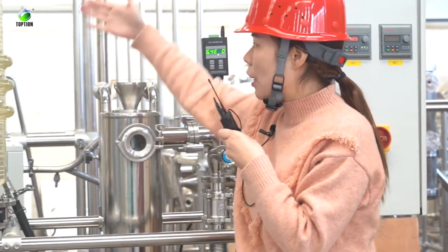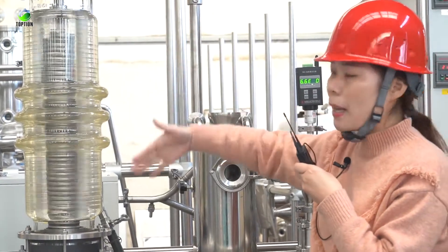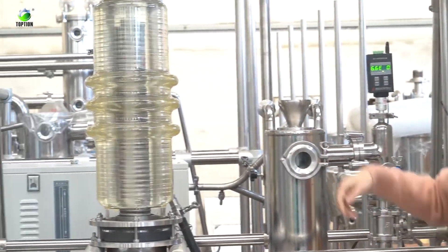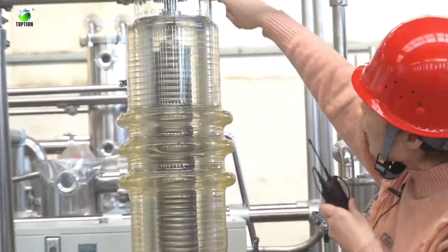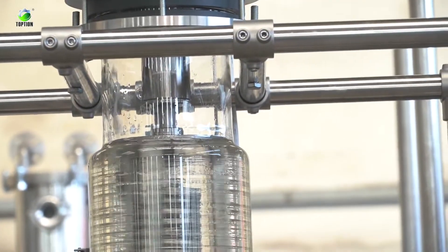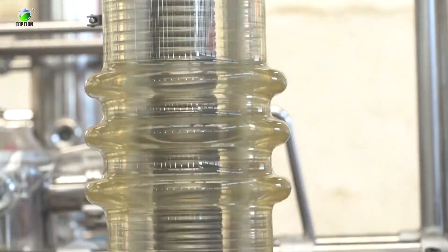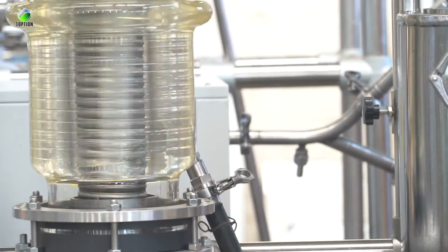Let's have a detailed look at the main evaporator — it is running now and you can see the oil coming out here, and it is swinging. That's all for our new design. If you are interested, please contact us at Toption Instrument.